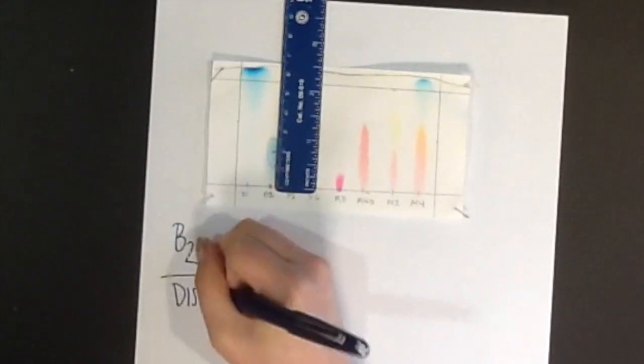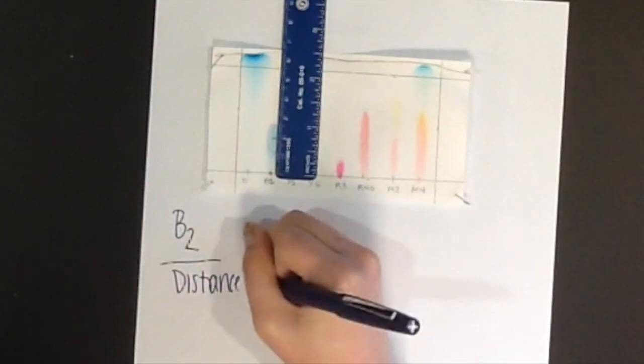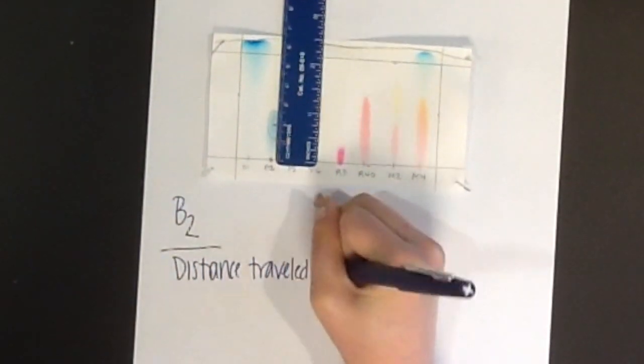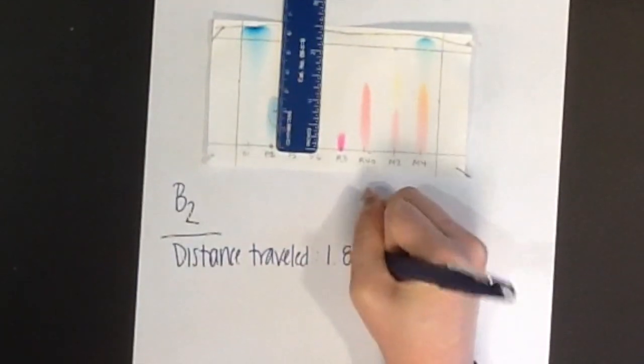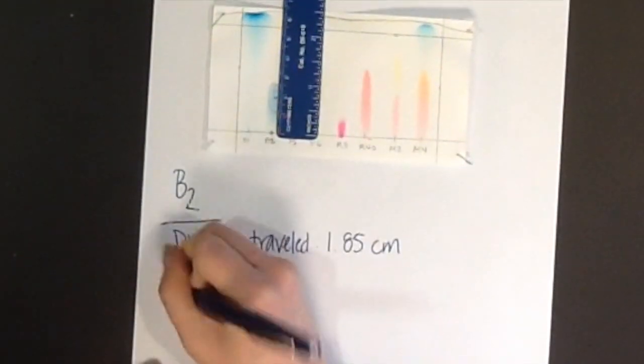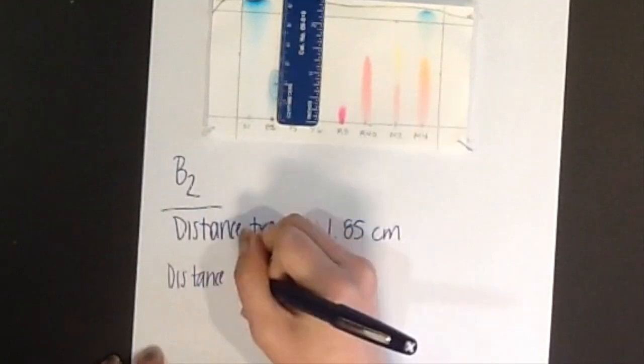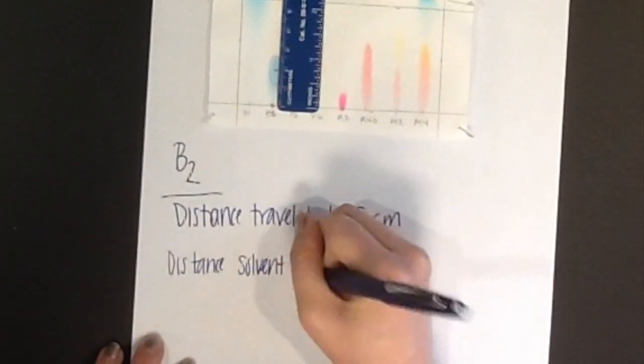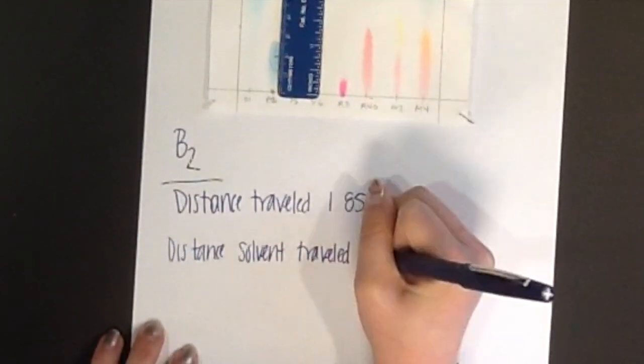Next, measure from the origin to the solvent front. This is the distance traveled by the solvent. The value for this is 6.29 cm. You will divide these two and your answer will be 0.294.